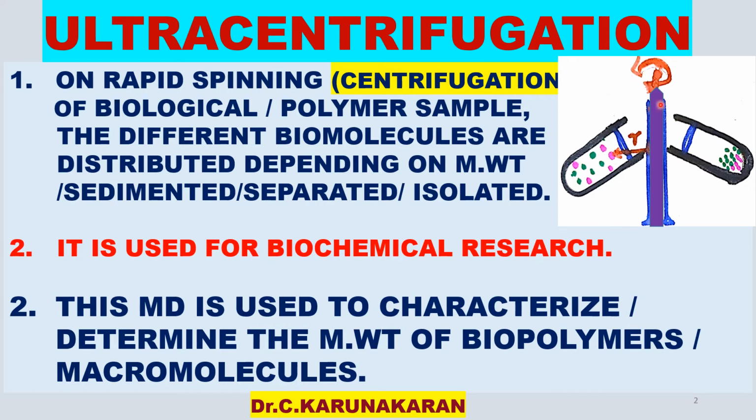For example, if you rotate yourself, if you spin yourself, then you will also fall down. Similarly, on rotating the suspended samples, the suspended particles will fall rapidly, sediment rapidly, and by using this method they are separated. See, they are separated depending on the molecular weight. High molecular weight molecules are at the bottom, whereas low molecular weight molecules are at the top. They are distributed depending on the molecular weight.